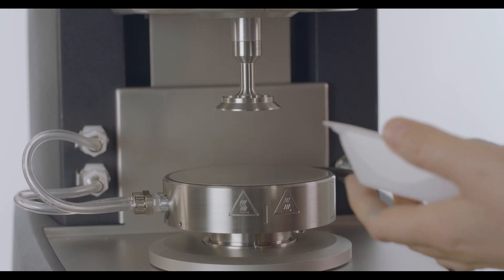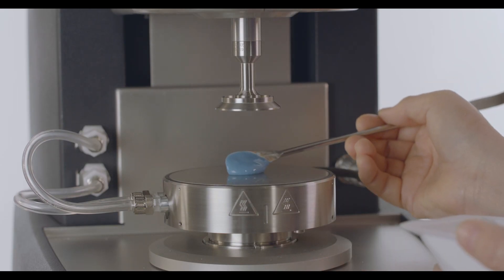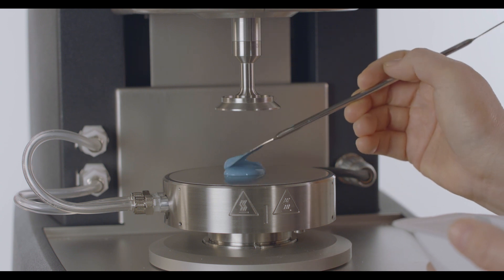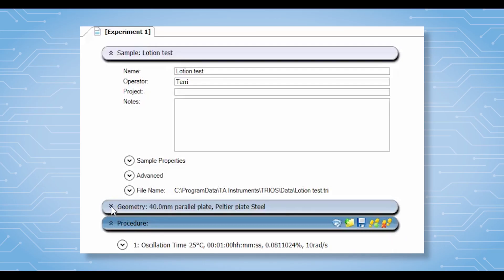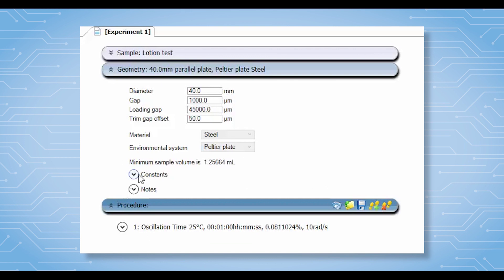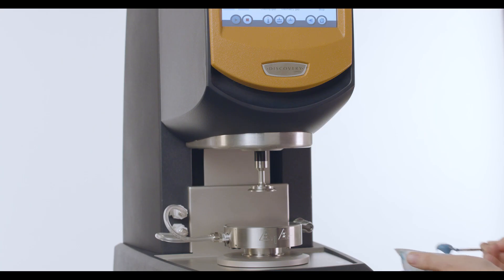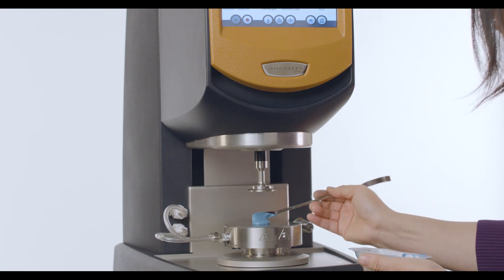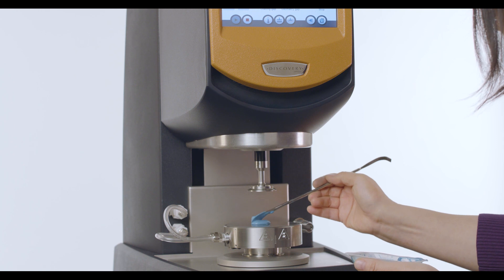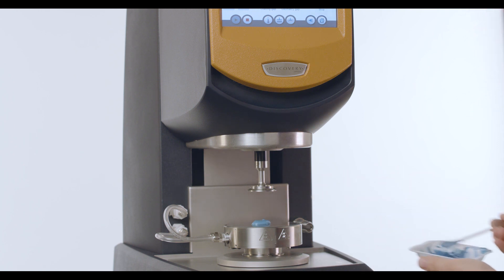When loading a liquid or soft solid sample onto a parallel plate or cone and plate geometry, TRIO software will provide you with the information about the minimum required volume. Unless you have a very limited amount of sample, it is always good to load slightly more sample than what is required, and then trim the excess amount.